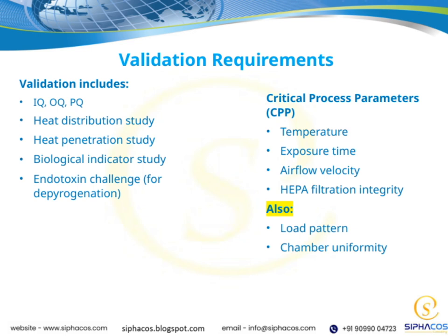Moving on to validation requirements, these are the steps we follow to confirm that our sterilization process is effective and reproducible. Validation includes IQ, OQ, and PQ: installation qualification, operational qualification, and performance qualification, each serving a specific purpose in verifying that the equipment and process meet our standards.